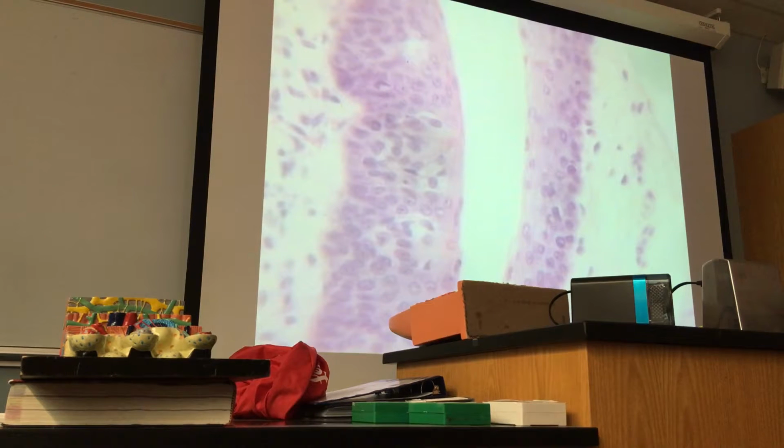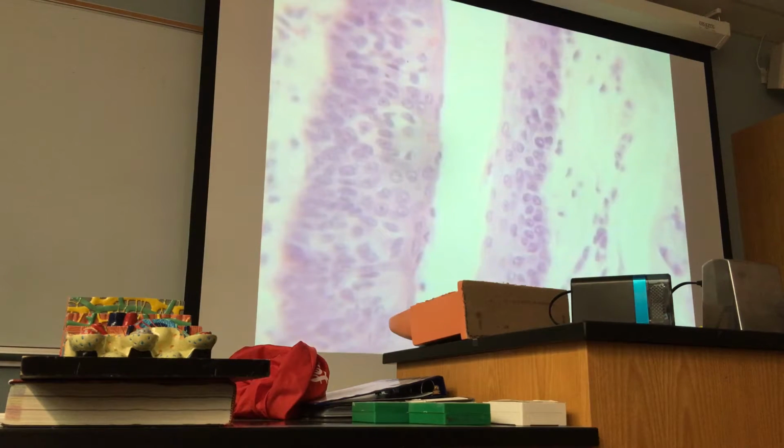These are special cells, sensory cells. And here is the taste bud pore. Okay? Many taste buds. This one, this one, this one. If you go to a histology book also, you can find the taste buds. If you want to see the taste buds, you have to go to chapter 17 that deals with special senses, okay?